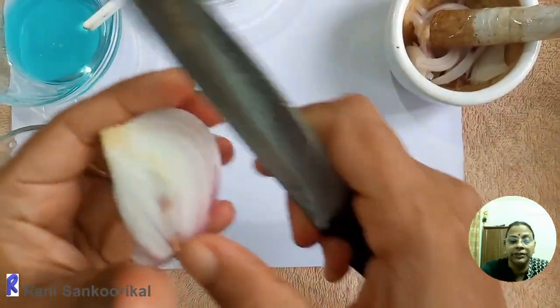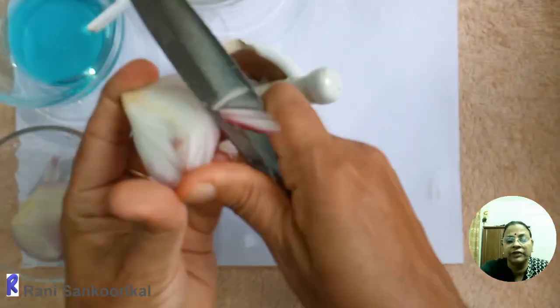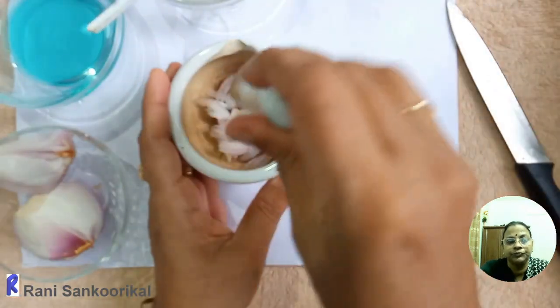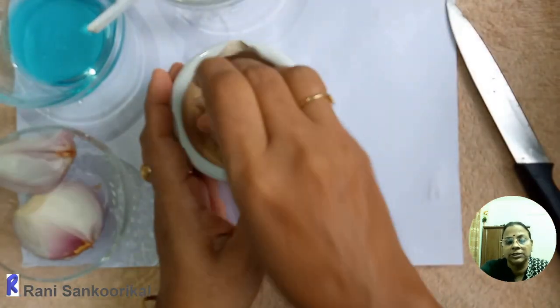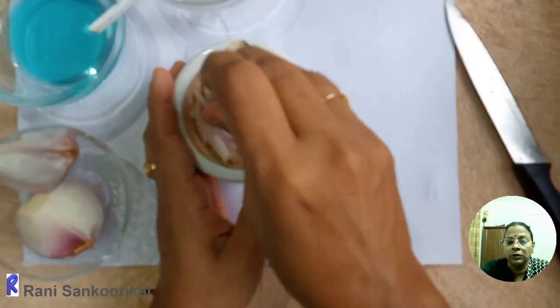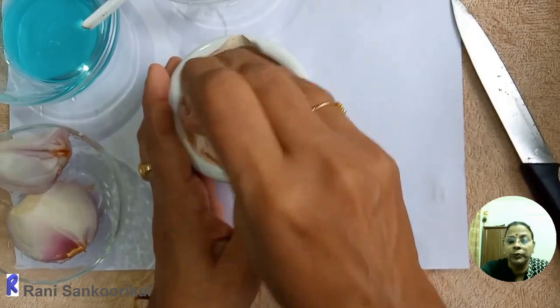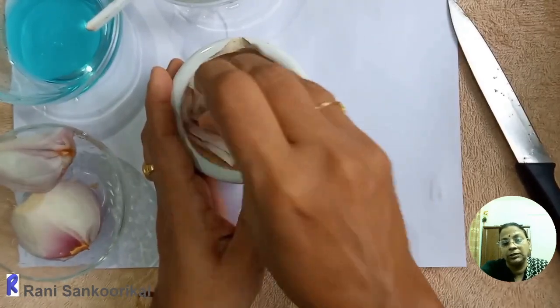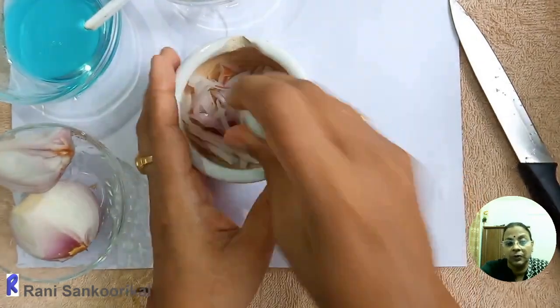First, take the onion piece and chop it into small pieces. You have to chop it very finely and put it into the mortar. With the pestle you have to crush the onion into small pieces. Make sure that it is not pasted. Instead, it should be crushed properly.